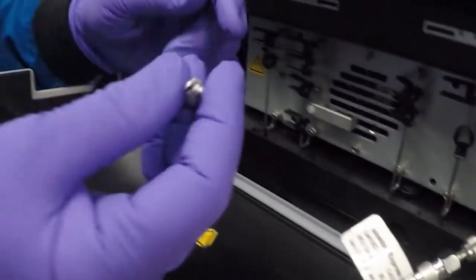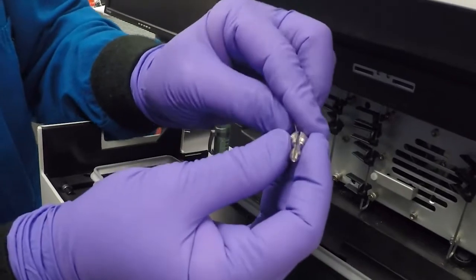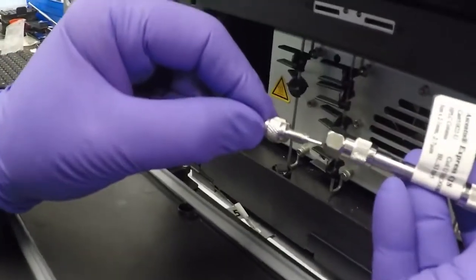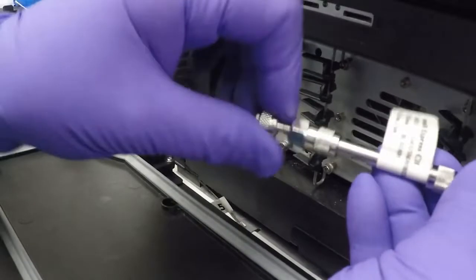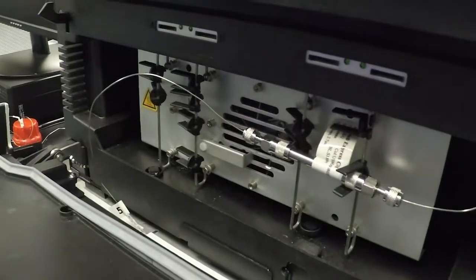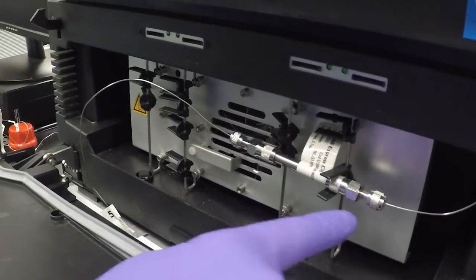On the outlet end it's the same thing — a slot that goes over and slides down over the thicker part. Slide it in. Then we want to put some flow on the column and check for leaks, either where the tubing goes in or at the outlet end.